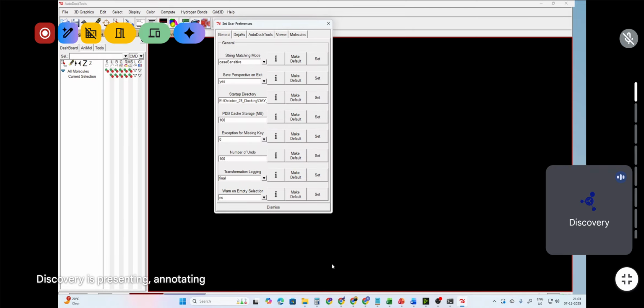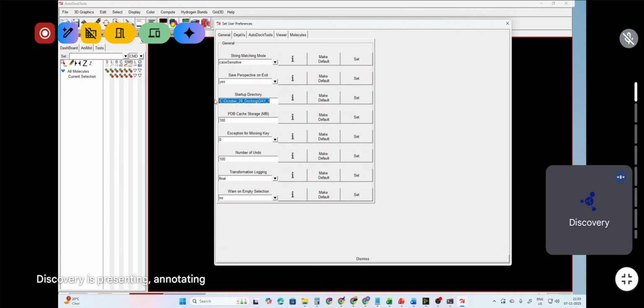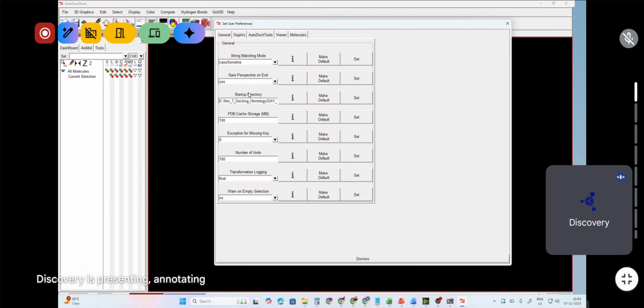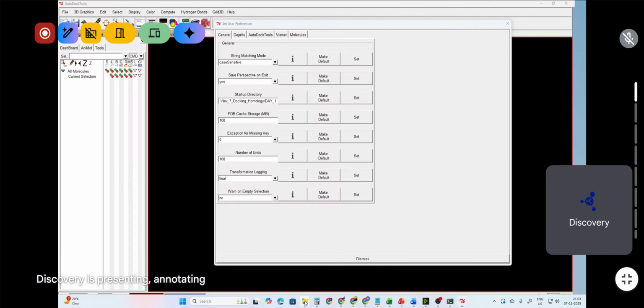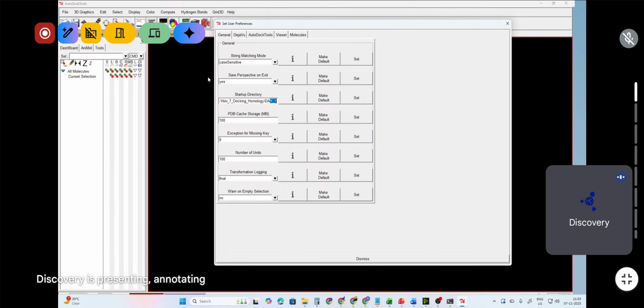This is optional, it's not required or compulsory, but it saves time, and also it helps us to avoid mistakes or error later on. Okay, so better to set the path of your working folder, the folder that I'm going to generate files and import files, okay, for my docking. Set the path of this working folder to your software.